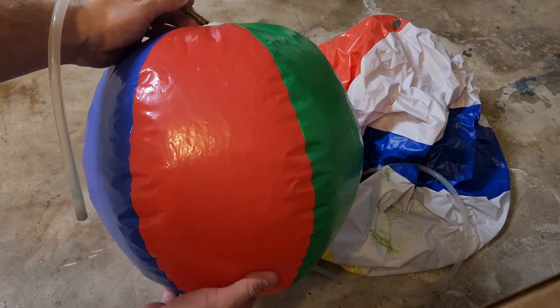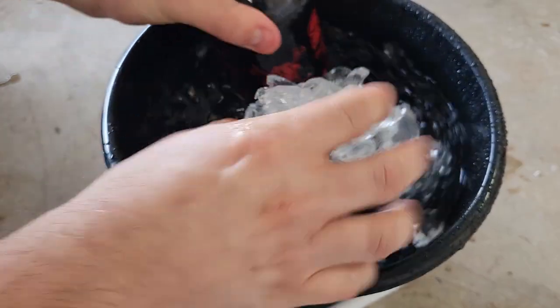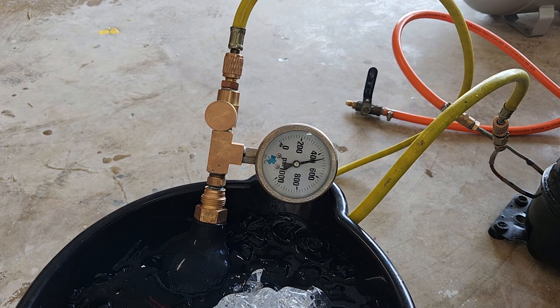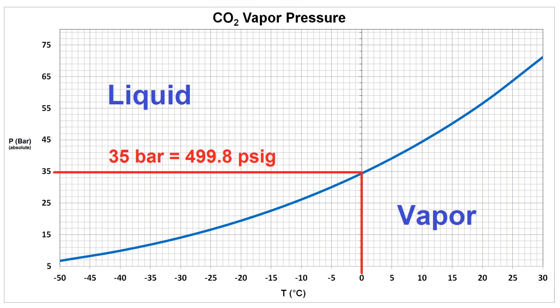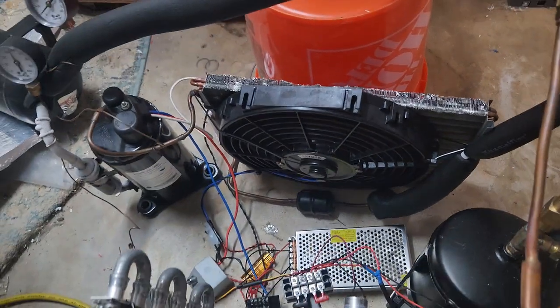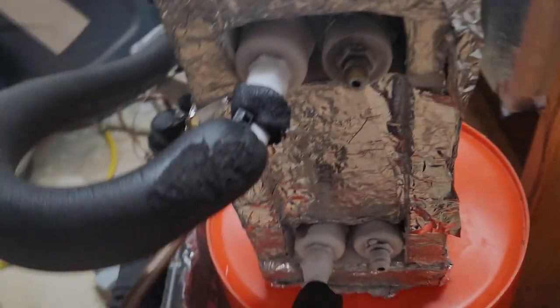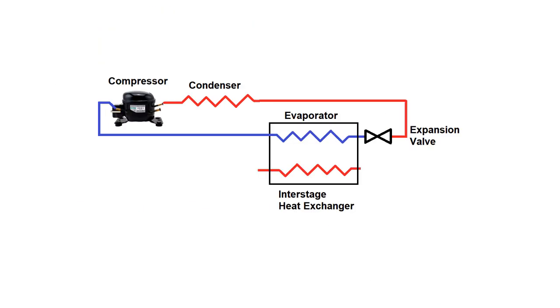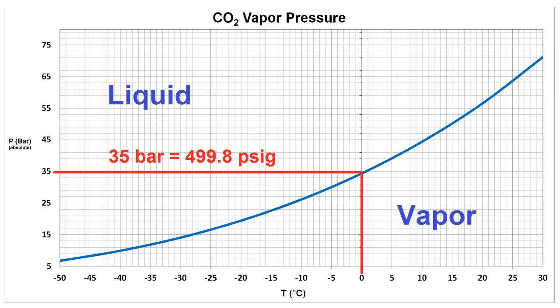Over a few days I continued dissolving seashells in vinegar and collecting the CO2 until I had enough to pretty much completely fill my big beach ball. In my last dry ice video I forced the CO2 to liquefy by compressing it in an ice bath, which required at least 35 bar — around 500 psi — that was a major hassle and really inefficient. So instead I'm going to borrow the pre-cooling stage of my Joule-Thomson cryo cooler: a propane vapor compression system connected to a plate heat exchanger on the evaporator.